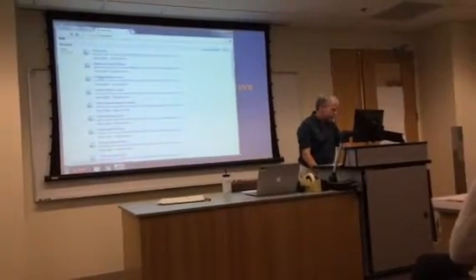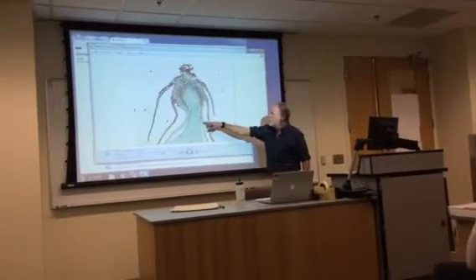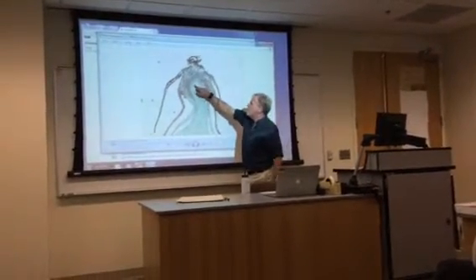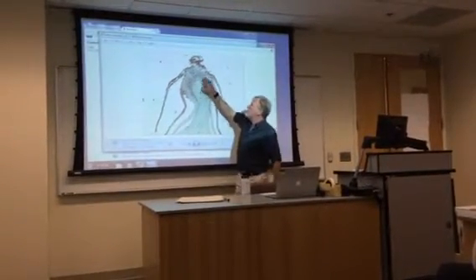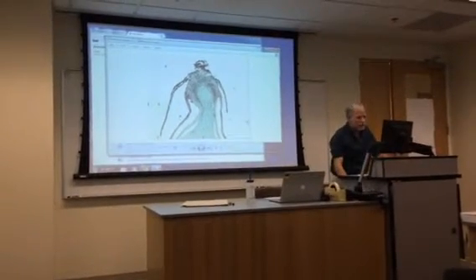Okay. And then here's the rest of it. So here's a seta, and there's a foot, and then here's the rest of the gametophyte. That would be the rest of the branch that it developed from. So a rounded foot in these guys.